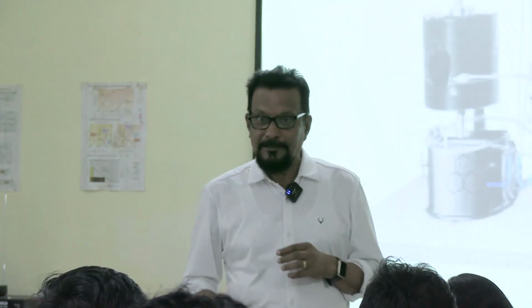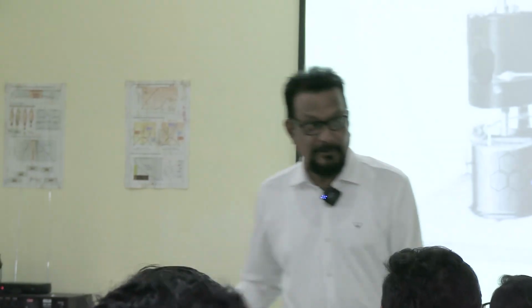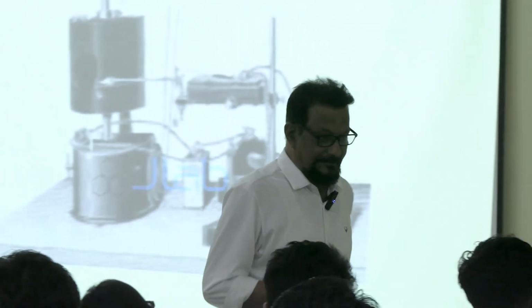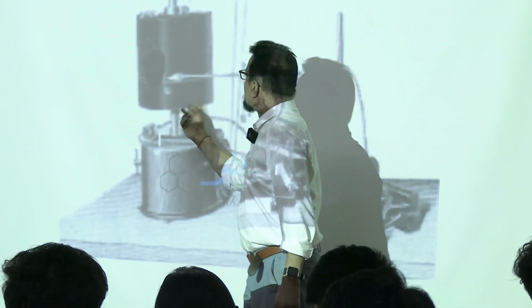So now, instead of the Du Bois-Reymond induction coil, modern devices can be used. But nowadays these are also not used, since there is no amphibian live experiment. So we are just telling how it has actually been done. Now this is the recording. With this, you can start it. It will start the movement.